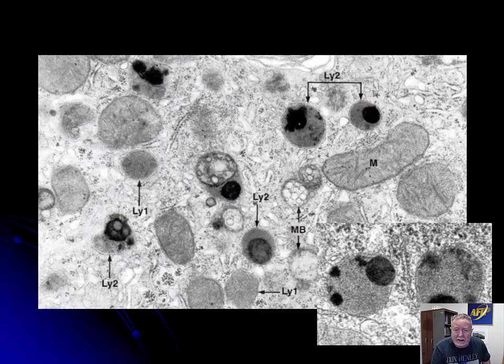Now, we've looked at mitochondria here. I'm looking at this one. It's sort of half and half. It's got some nice long cristae, not a lot of them, so I can't tell much about that. I've got rough endoplasmic reticulum here. I've got a lot of smooth endoplasmic reticulum. Usually, in just about any EM, you'll be able to pick out smooth endoplasmic reticulum. It's always a little swollen in certain areas just because of the processing.